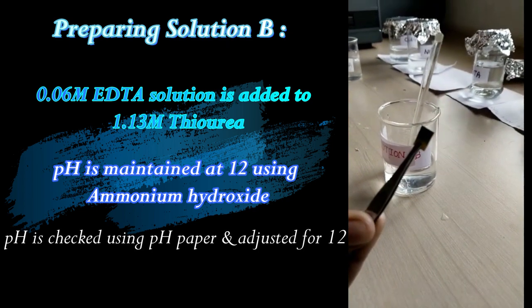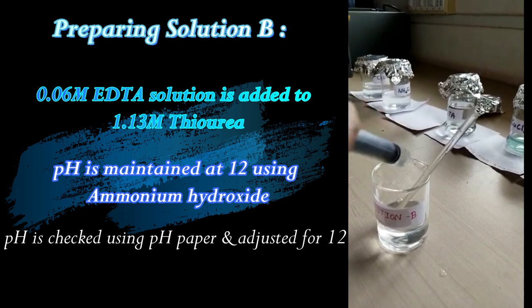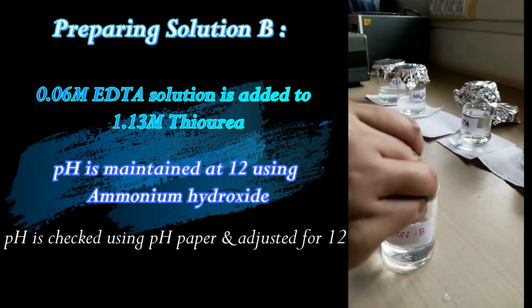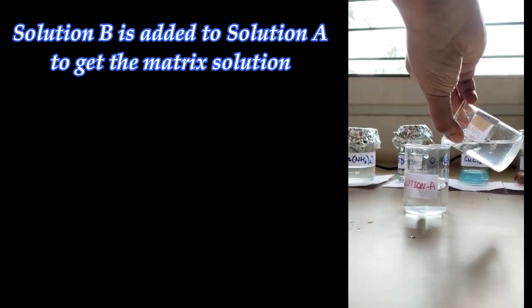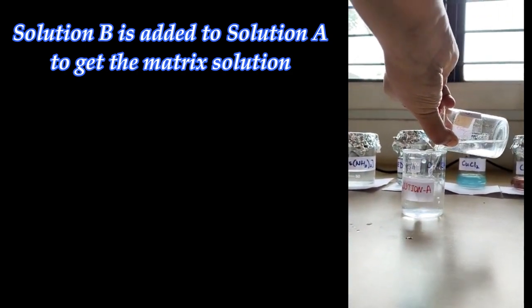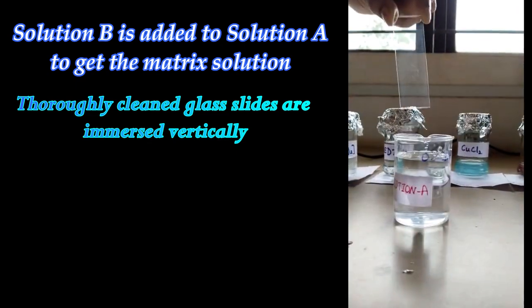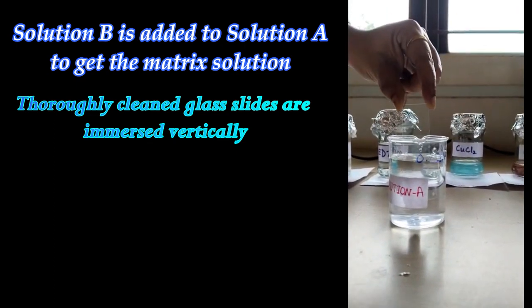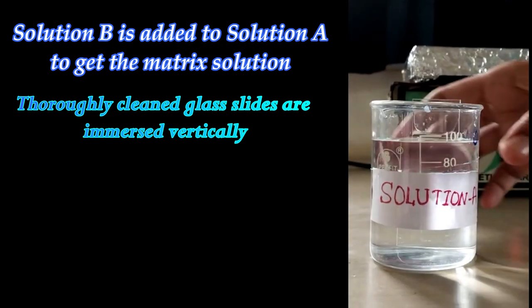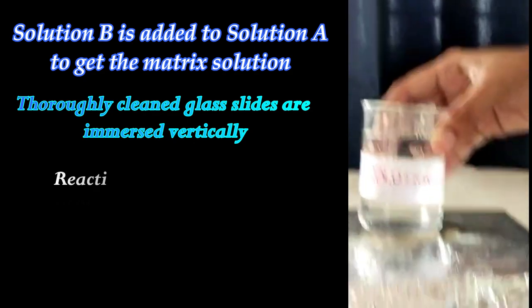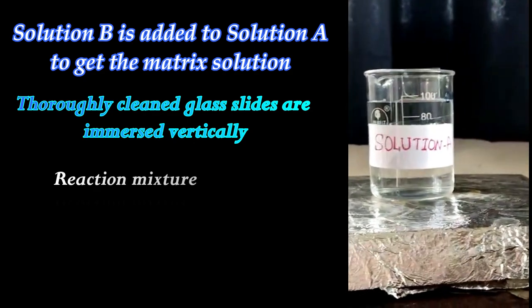Finally, solution B is added to solution A. That is, the solution containing the sulfur source is added to the solution containing cadmium source. Then thoroughly cleaned and dried glass slides are inserted in this reaction mixture and kept for heating on the heater.